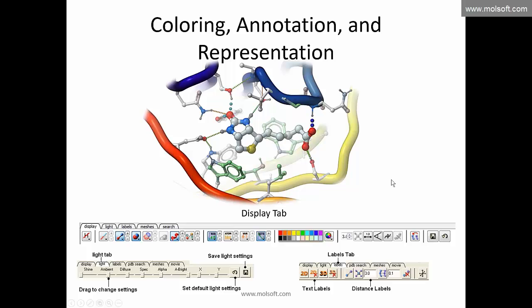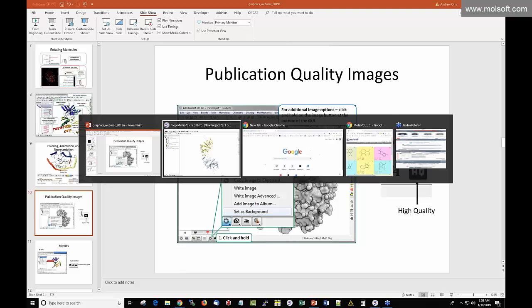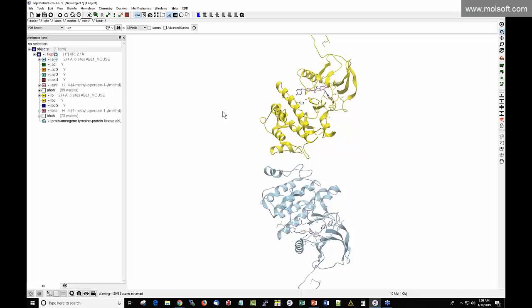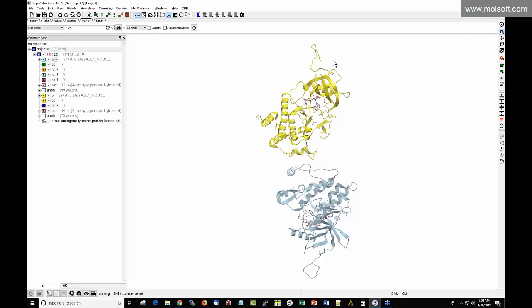Our structure 1IEP has two chains — chain A (blue) and chain B (yellow). The colors in the workspace match the graphical display. I loaded this by going to PDB search and typing 1IEP. Since we're only interested in the A chain, I'll undisplay all molecules in chain B.